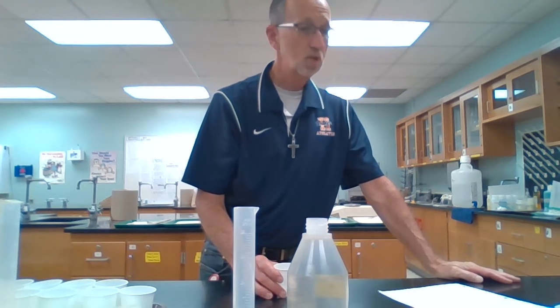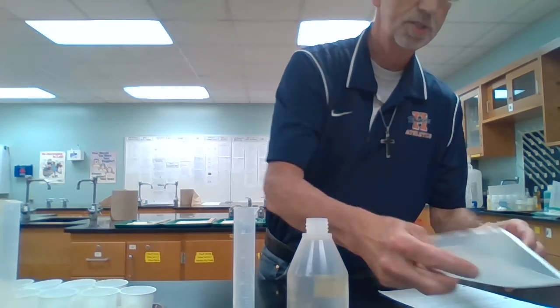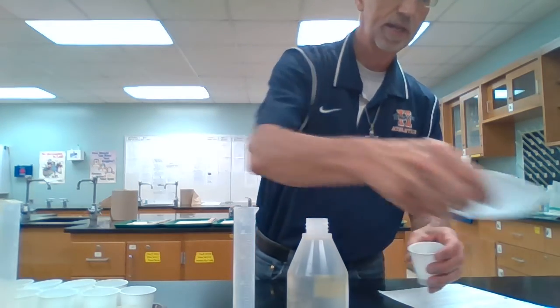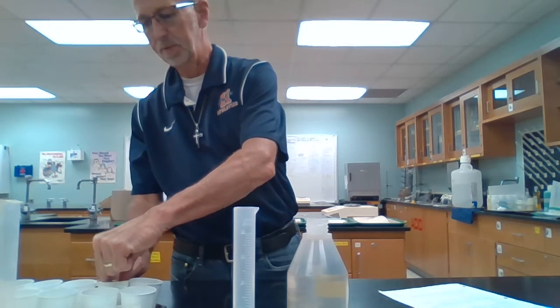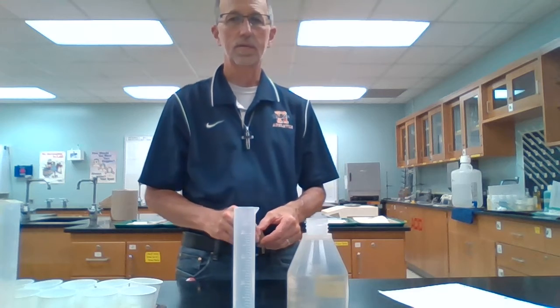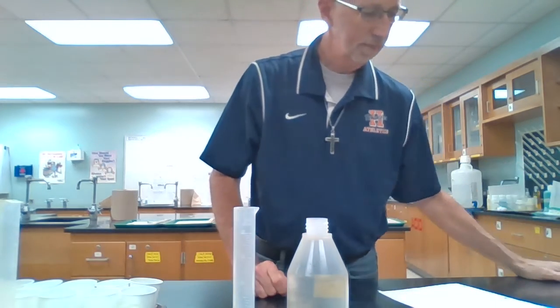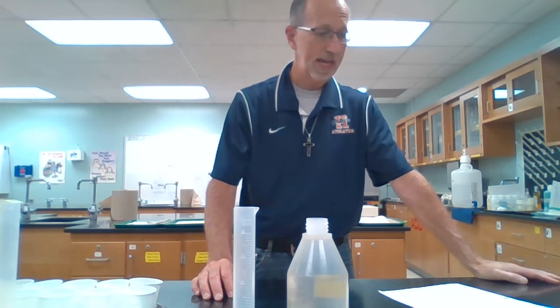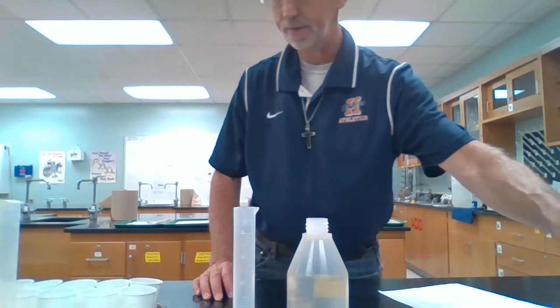And it says 20.12 grams, 20.12. Put those back in there. Now, copper sample 2 is actually a regular solid, so think about that when we do volume. I'll go ahead and put that right there. And the mass is 142.08 grams. So that's the mass of copper for number 2, 142.08.